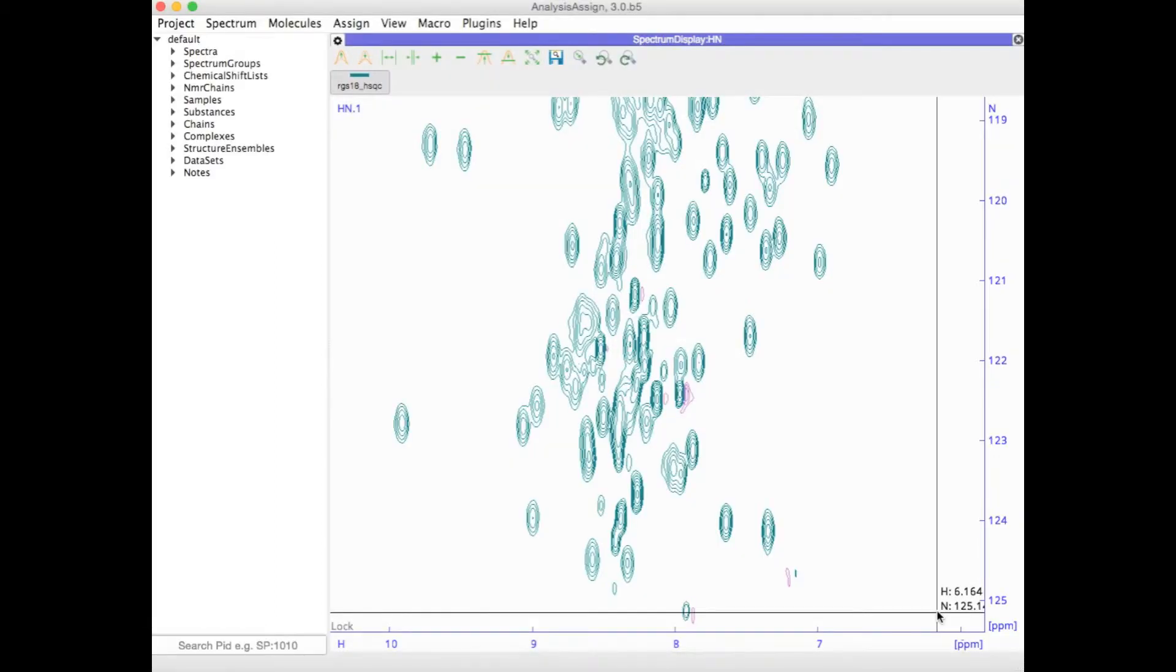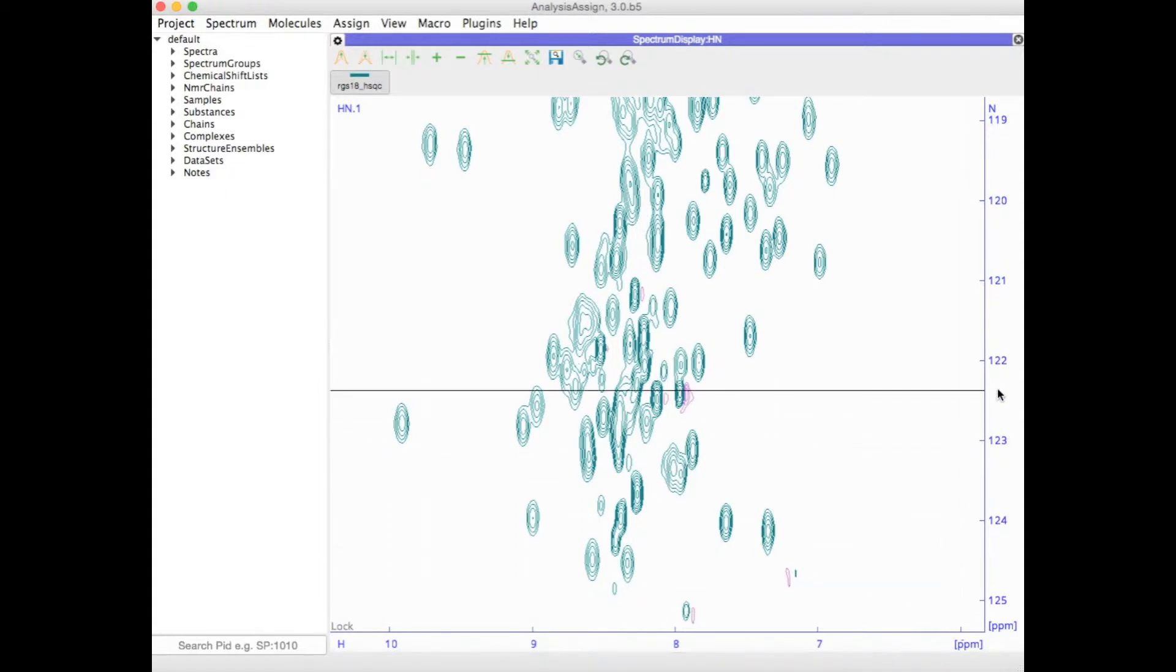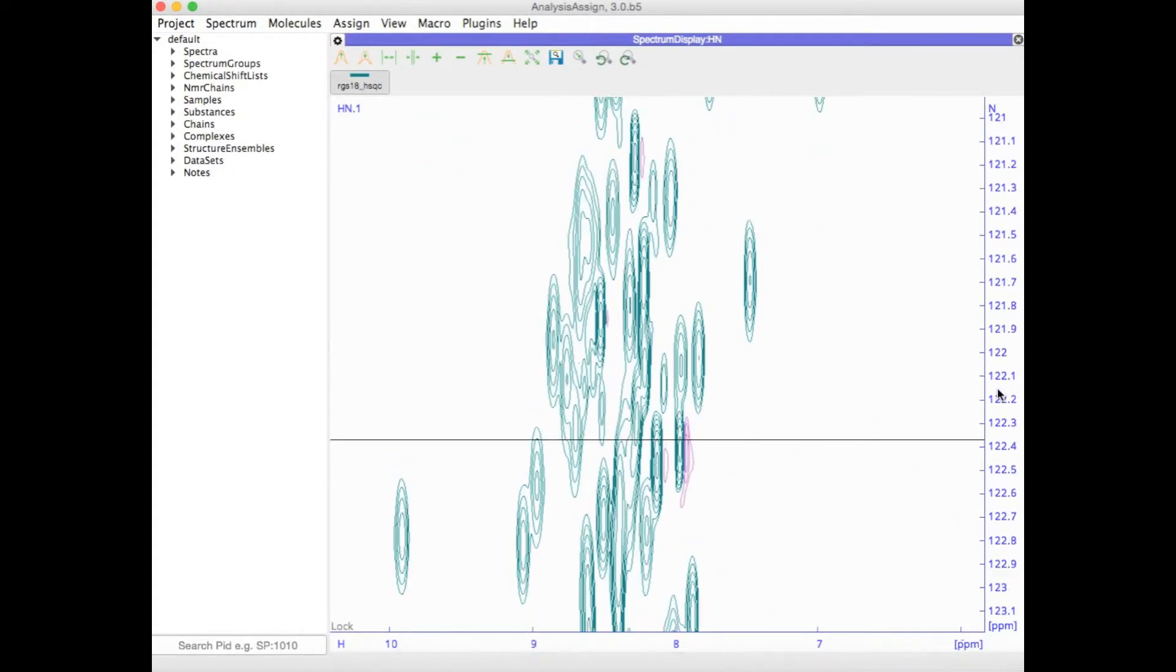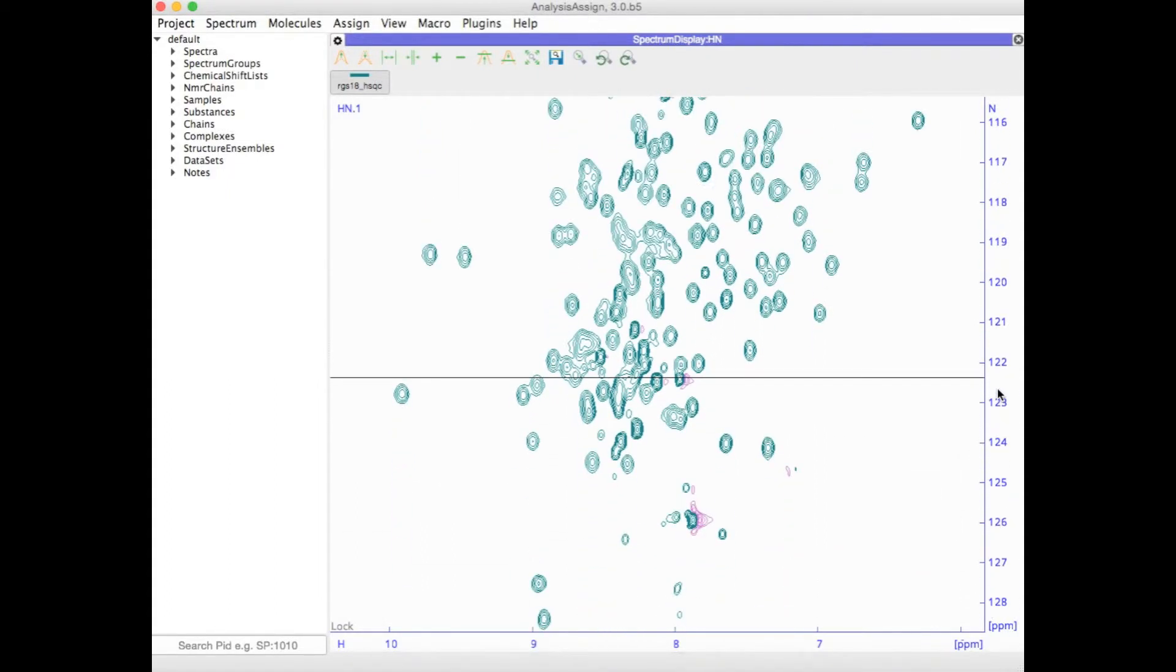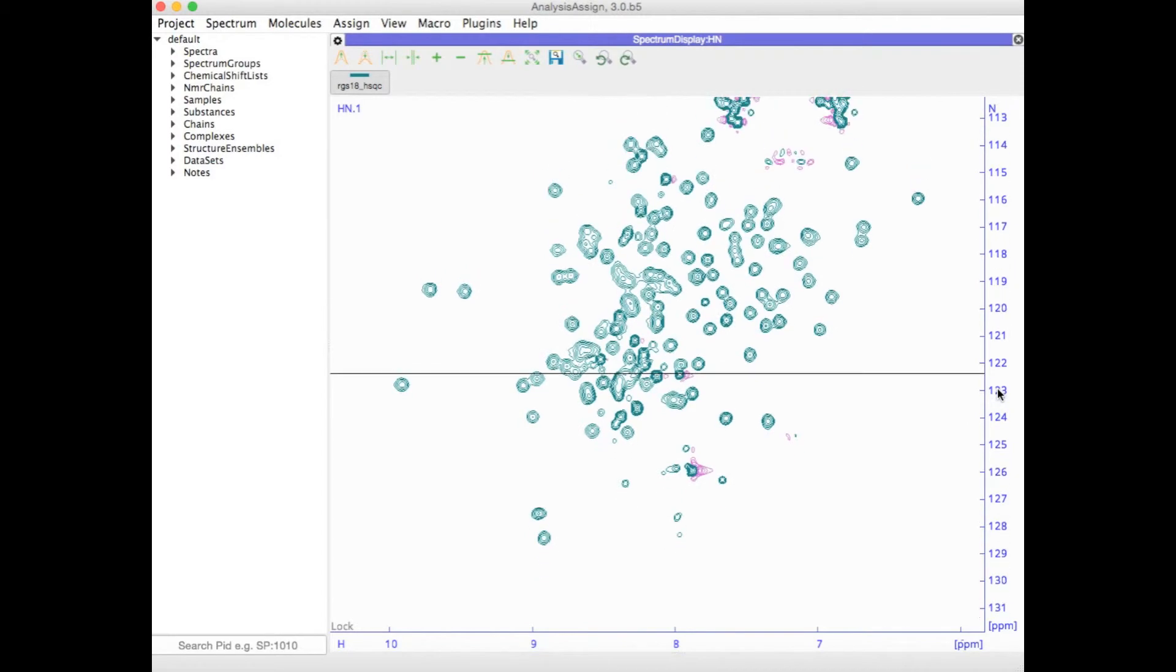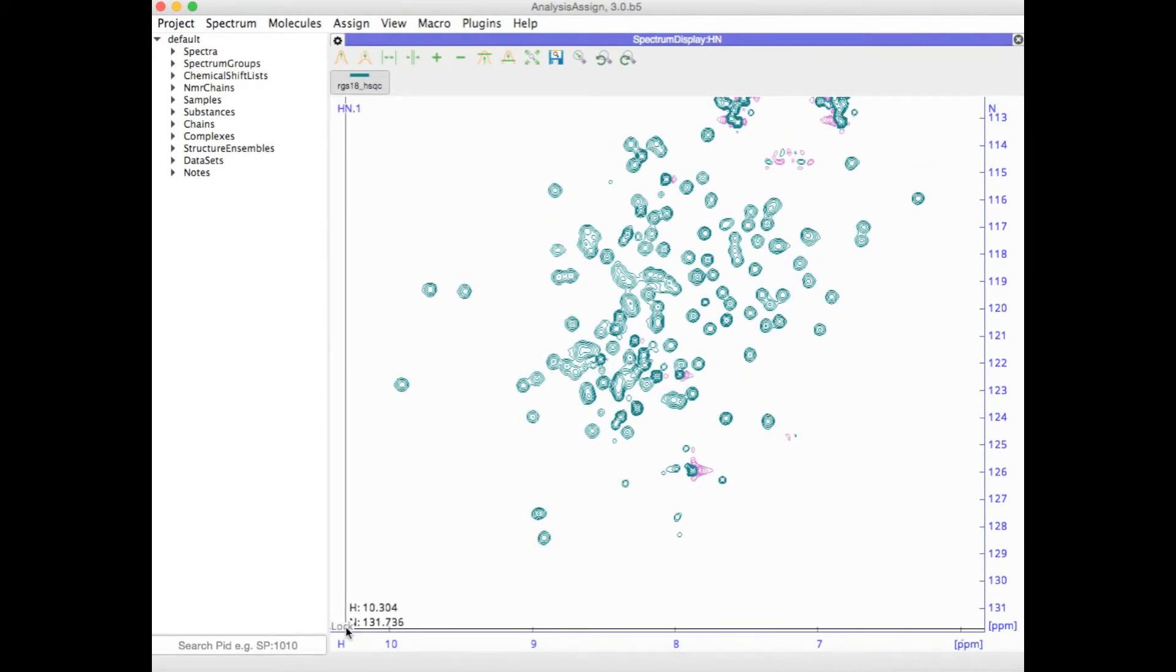If you don't like the aspect ratio of your spectrum display, simply zoom while you're on one of the axes until you are happy with the setting, and then click on lock to lock it in place.